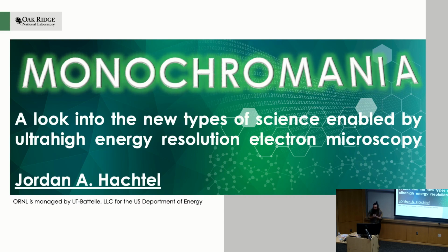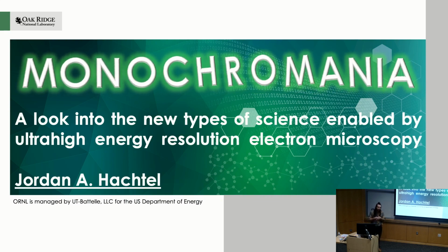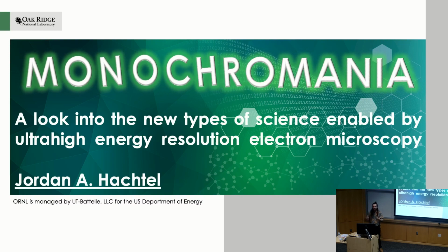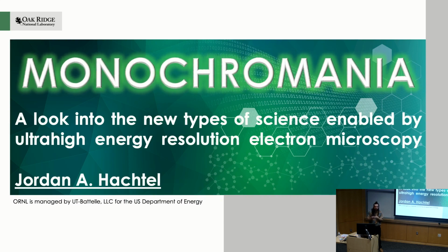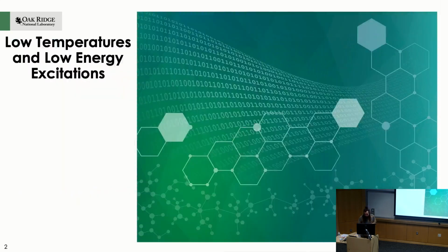So, as Matthias said, I'm Jordan Hachtel. I'm from Oak Ridge National Laboratory, and the experiments I'm going to show to you today are all from a technique called monochromated EELS. I want to keep in the focus of your mind that monochromated EELS is a technique that had been around for ages, but we've recently had some developments that improved the power of the technique by about an order of magnitude. It's funny because it wasn't just an improvement of resolution, like new things became possible at this level of energy resolution that were fundamentally not possible to do before. So it's really opened up brand new fields that we could have never even dreamed to look at. And I wanted to go through a couple of them today and show you how new types of science have been enabled by this new technique.